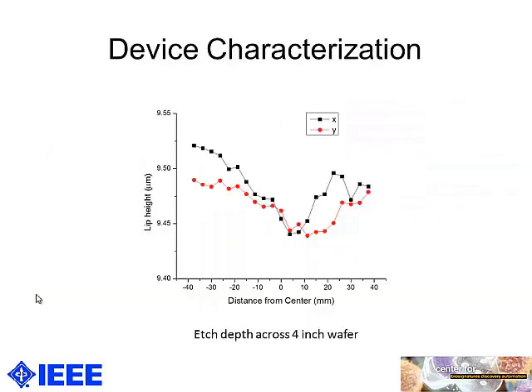As I talked about earlier, if we want to get accurate detection of the parameters, it's critical to have the same microchamber volume for the metabolic experiments. That means the etch uniformity across the whole wafer is one of the most important parameters for the wet etch process development.